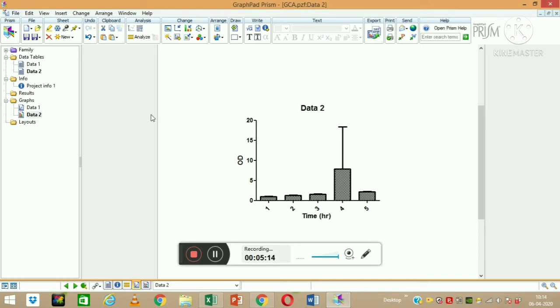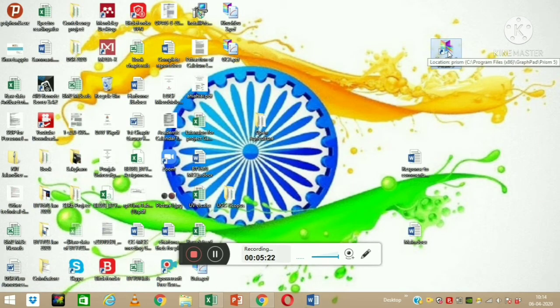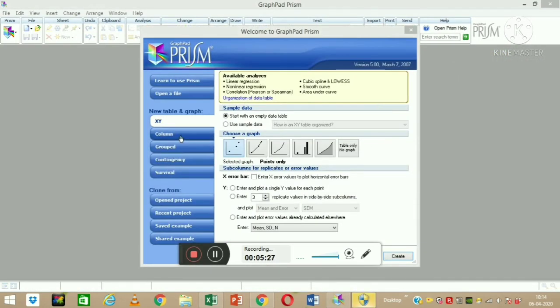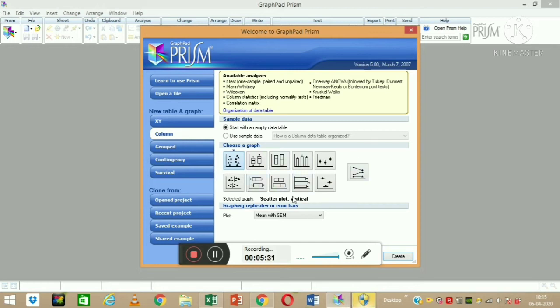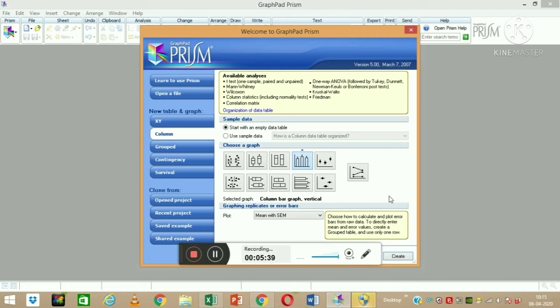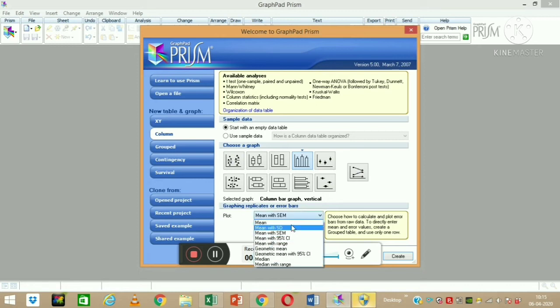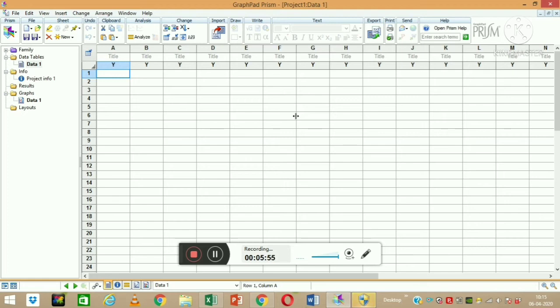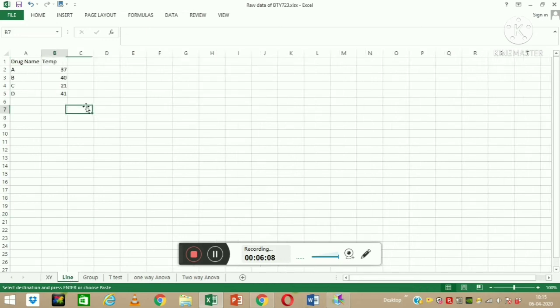We can save this XY scatter graph. Next, we will learn how to make column diagrams. I'll go to the Column option and select the column graph type. Usually we prepare column graphs in research or project work. It is asking whether you want to plot mean with standard deviation or mean with standard error. I want to plot only mean values, so I'll select that and click Create. In a column diagram there are no X values, only Y values.